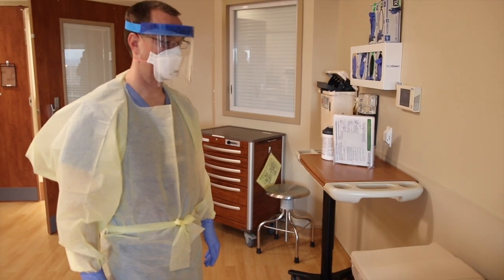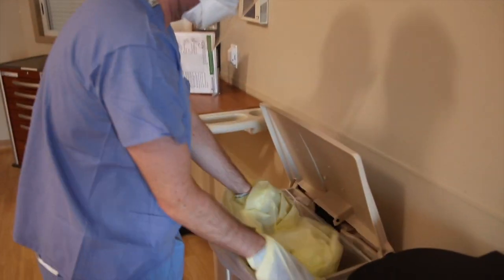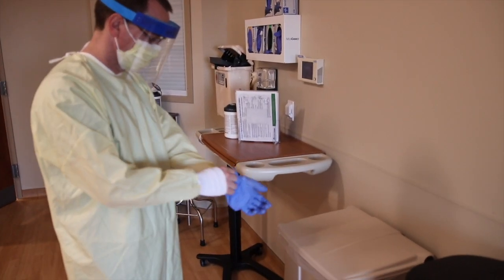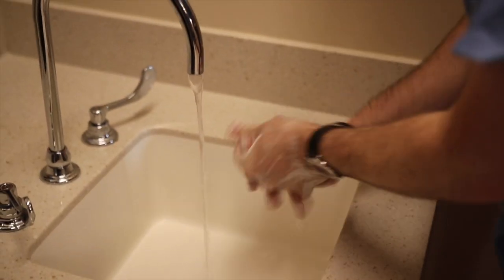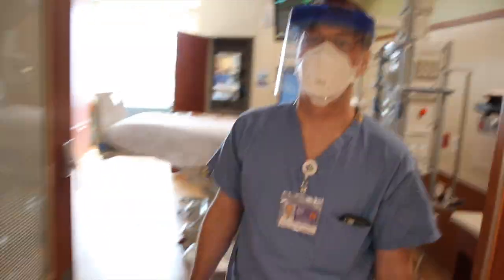If you are using a disposable gown, you can take off your gown and gloves simultaneously, removing the gloves from underneath and placing them in the trash can inside of the patient's room. If you are using a reusable gown, you will start by removing the gloves from underneath, placing them into the trash can, and then placing the reusable gown in the laundry bin. Wash or sanitize your hands inside the room. You may then grab your clean equipment and exit the room.